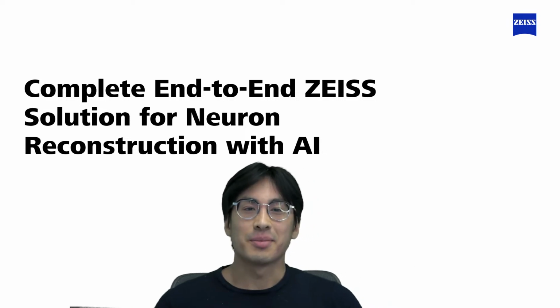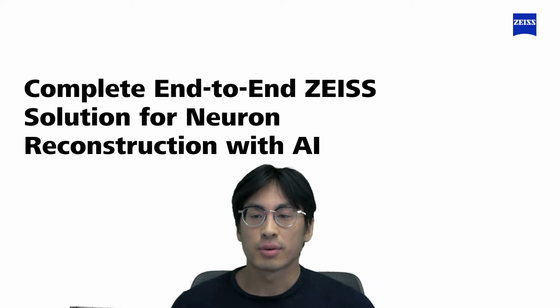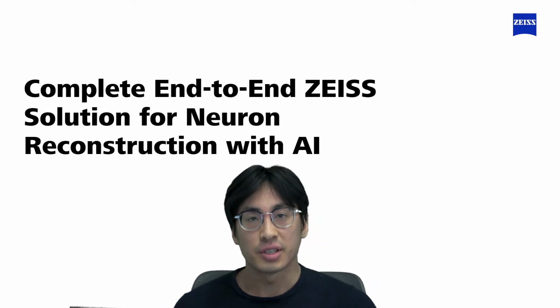Okay, so getting to the meat of the topic today, I'm going to be showing you a complete end-to-end ZEISS solution for neuron reconstruction with AI using arivis.